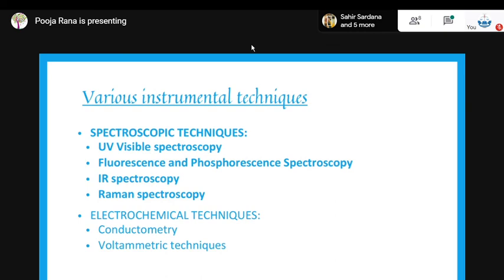Now, it is used to identify and analyze the chemical structure and even the biochemical structure of any component. And this is the main instrument used to produce an infrared spectrum, irrespective of the nature of matter, whether it is a solid, liquid, or gas. When the wavelength of the infrared radiation is identical to the vibrational frequency of a particular molecule, absorption takes place. Similar to absorption spectroscopy, the examination of transmitted light provides information about the amount of energy which is absorbed.